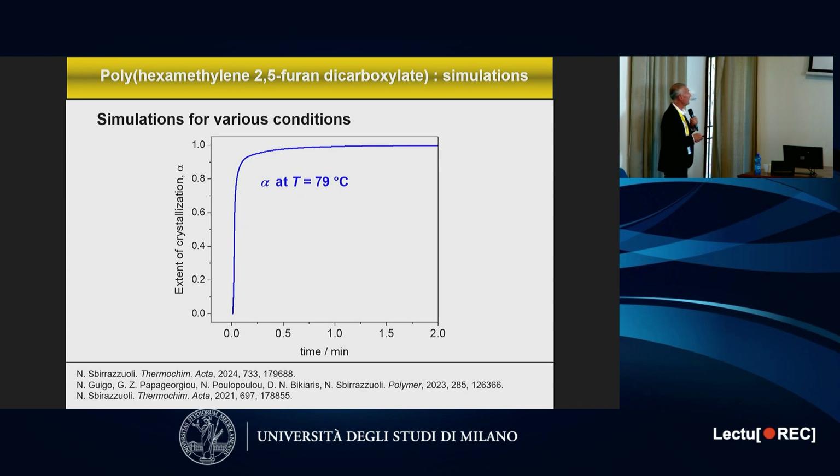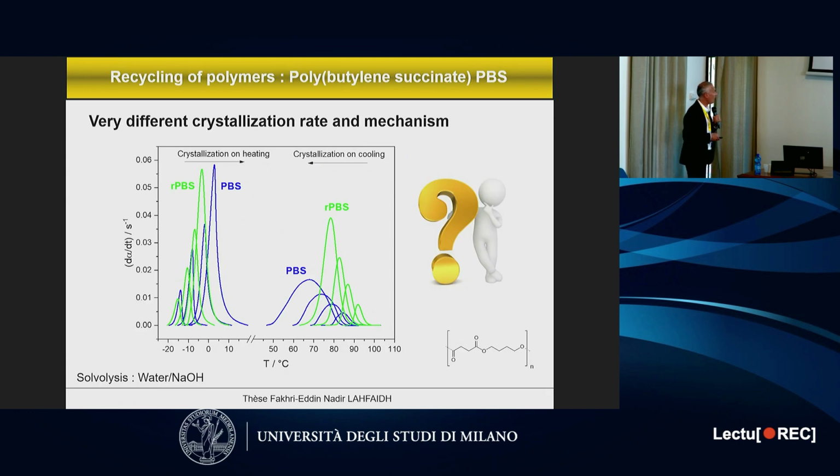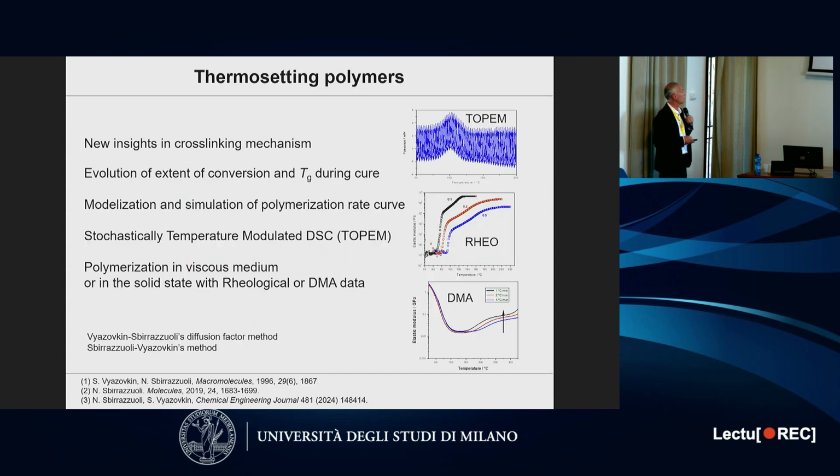So as you can see here, we can fix an extent of crystallization and see the time according to the temperature we want. And why it is also very important, because now we also study recycling of polymer. And what we noticed is that the crystallization rate of recycled polymer is very different. So there is a lot of interest to study this mechanism.